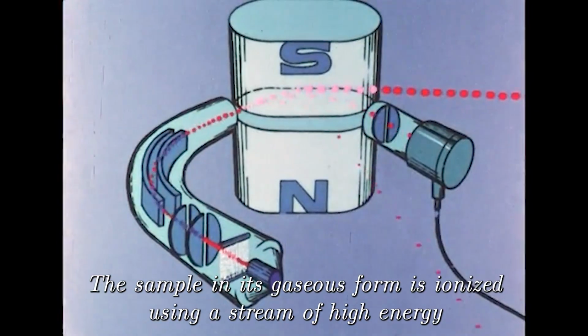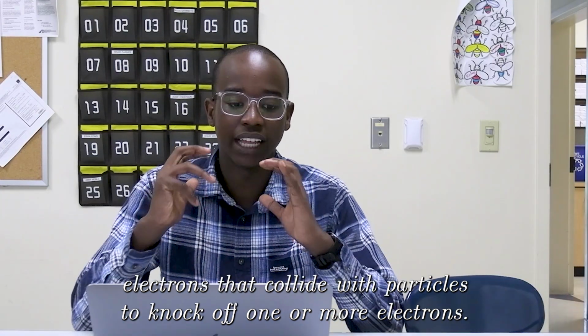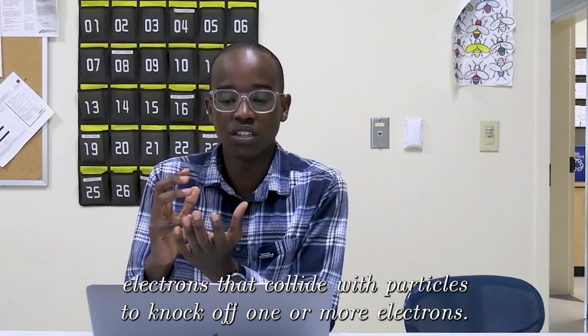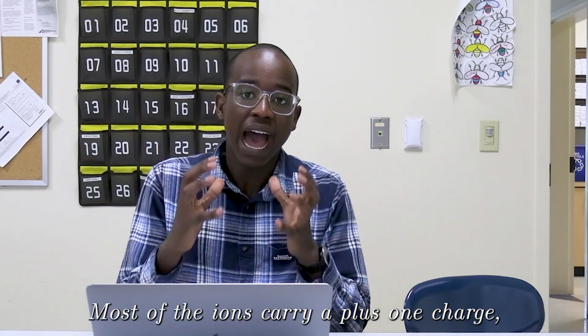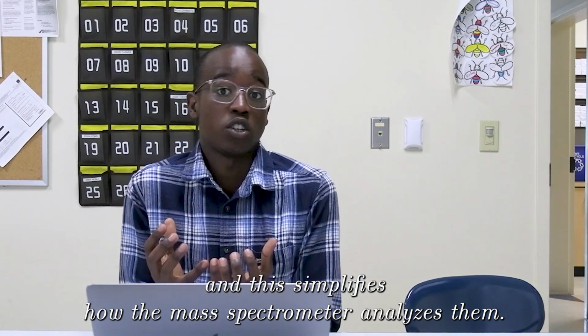Next, the sample in its gaseous form is ionized using a stream of high-energy electrons that collide with particles to knock off one or more electrons, creating positive ions. Most of the ions carry a +1 charge, and this simplifies how the mass spectrometer analyzes them.